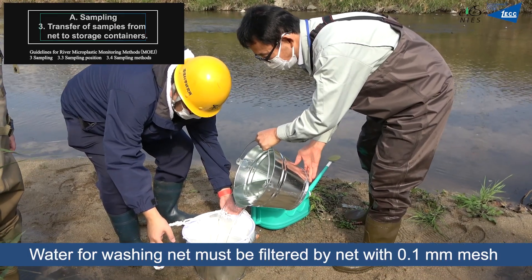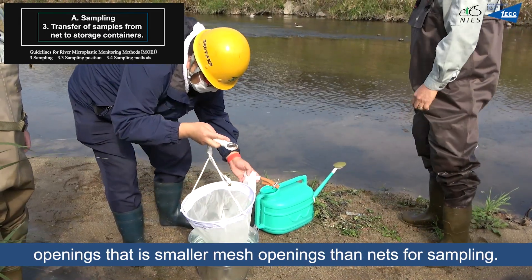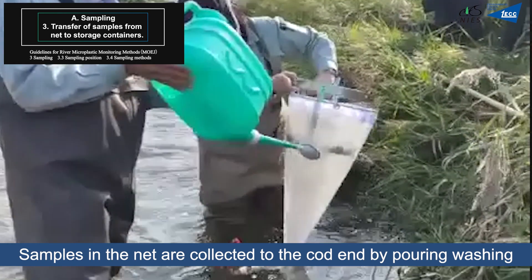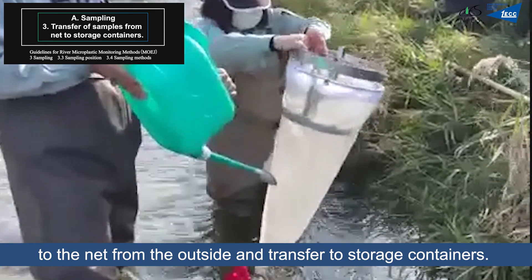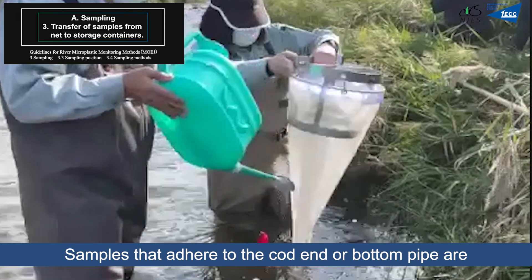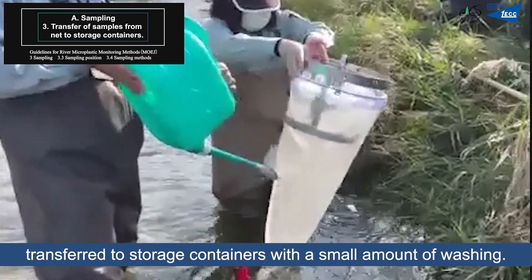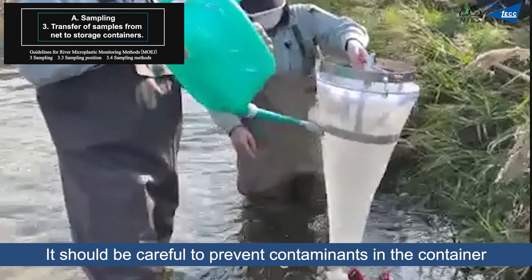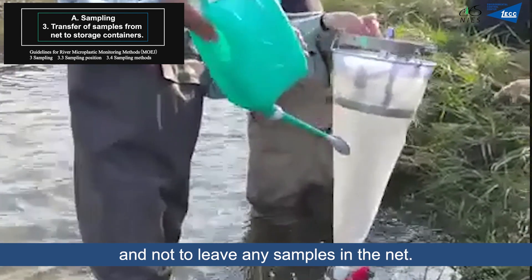Wash water from the net must be filtered through a net with 0.1mm mesh openings, which are smaller than the sampling net openings. Samples in the net are collected to the cod end by washing the outside of the net and transferred to storage containers. Samples that adhere to the cod end or bottom pipe are transferred to storage containers with a small amount of wash water. Care must be taken to prevent contaminants entering the container and not to leave any samples in the net.